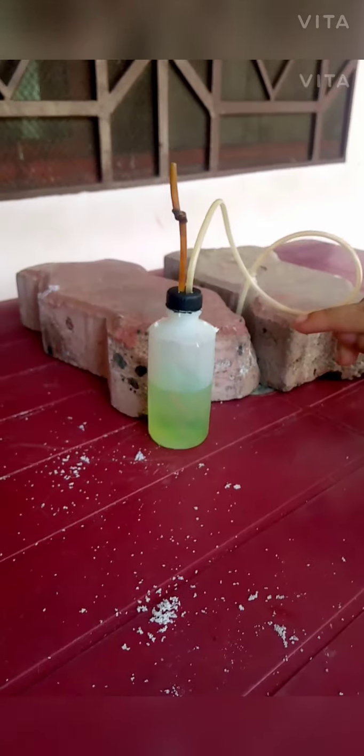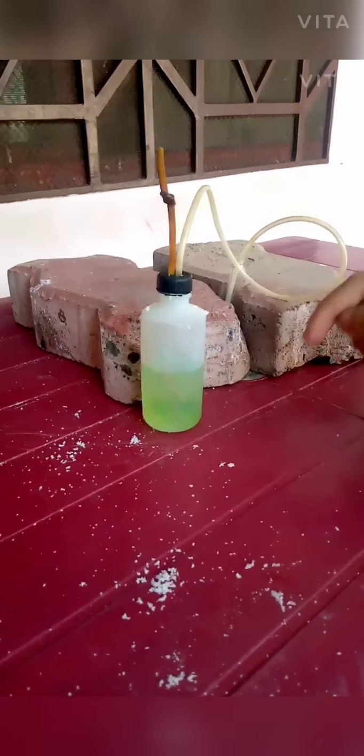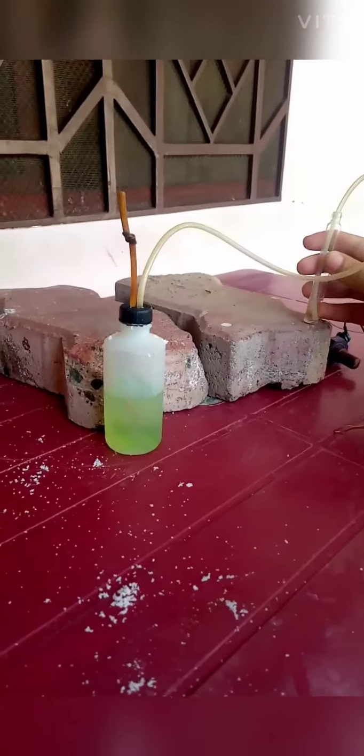It took a long time. I add more acid and more aluminium nitrate to act as the catalyst. It should be faster, but it is quite slow. I have added a total of roughly 20 grams of aluminium nitrate right now.